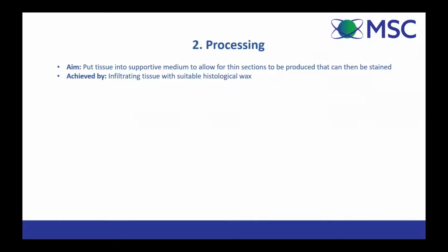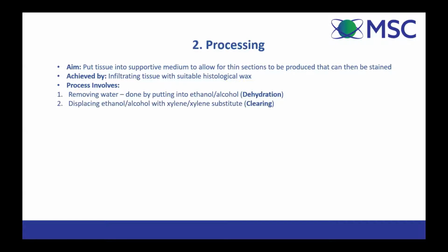We achieve this by infiltrating the tissue with suitable histological wax, in the case of paraffin, of course. This process involves, firstly, removing the water, which is done by adding ethanol or alcohol in a process known as dehydration.